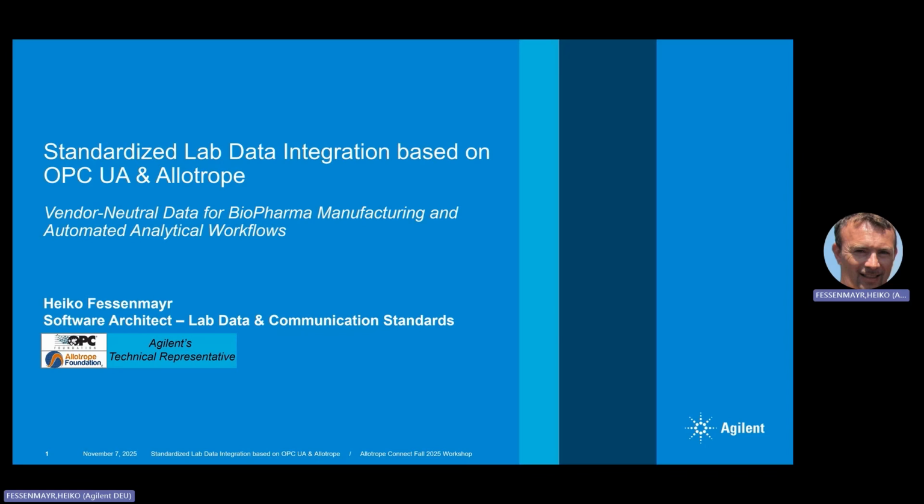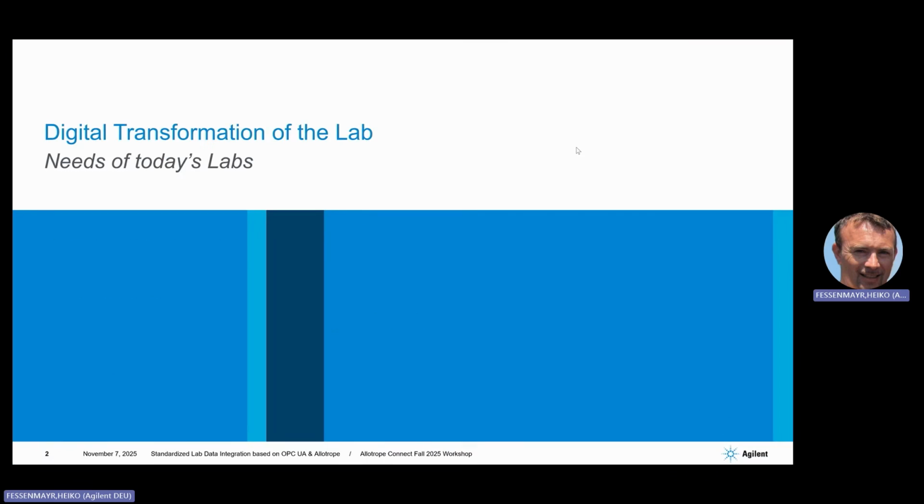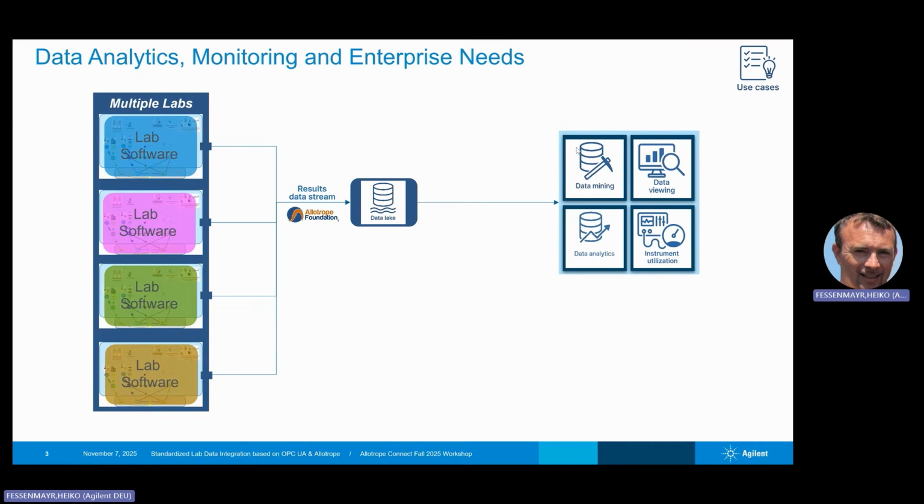So what are the needs of today's labs? It's foremost in the area of data analytics, monitoring, and also there are enterprise needs. Various software produce proprietary data formats, and Allotrope data formats do a great job providing them as a vendor-neutral format to put them into a data lake and to serve the needs which are shown here on the right side.